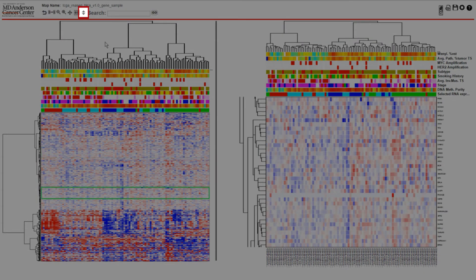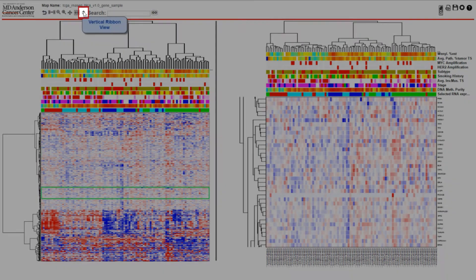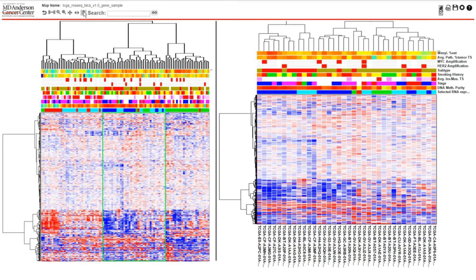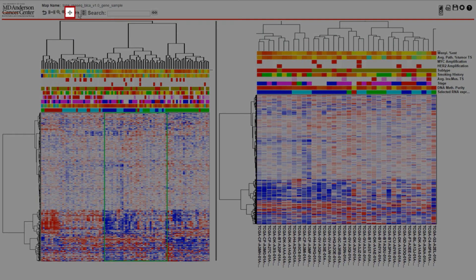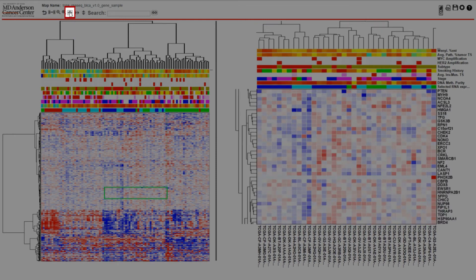Similarly, the vertical ribbon view can be used to see the entire height of the heat map along with the column labels. To return to normal mode, just select the normal mode button.